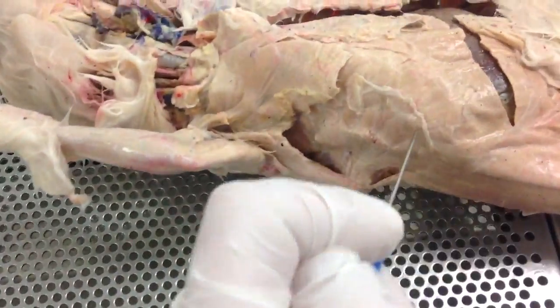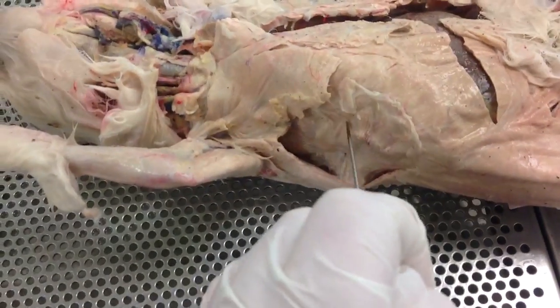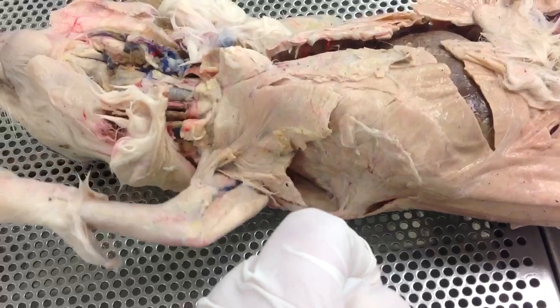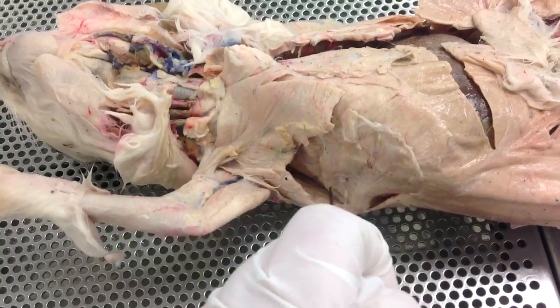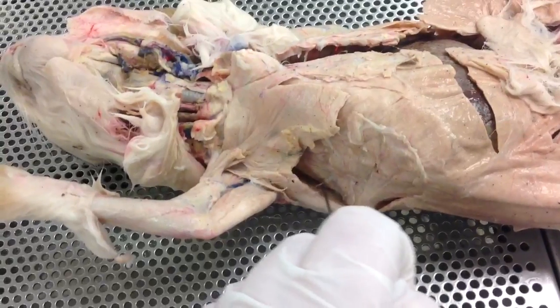Your teres major and your serratus ventralis are more easily viewed on this side of the rabbit. If you look under the arm portion, right through here, this is going to be the fan-like shape — that's your serratus ventralis. Underneath of that, this muscle that's down here is going to be your teres major. So serratus ventralis, teres major.